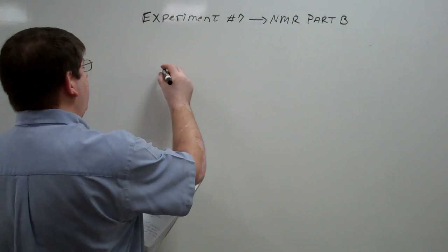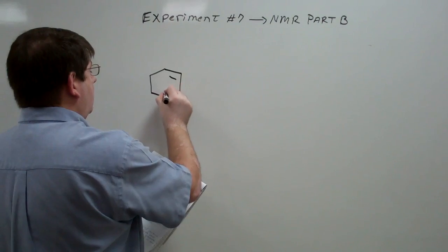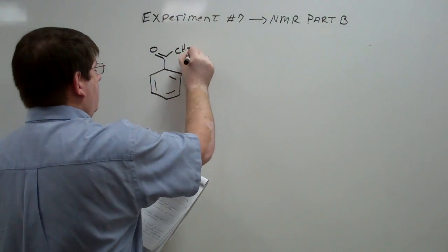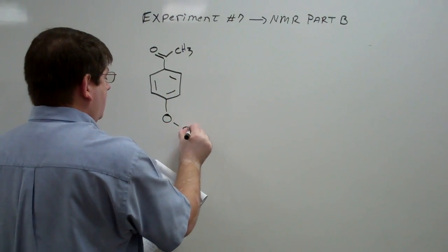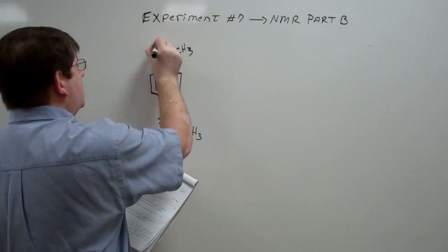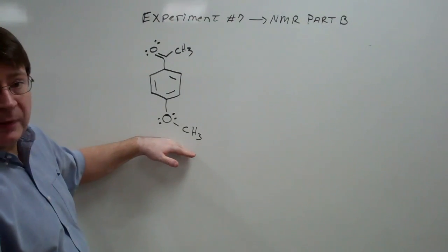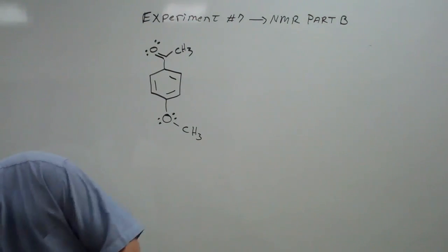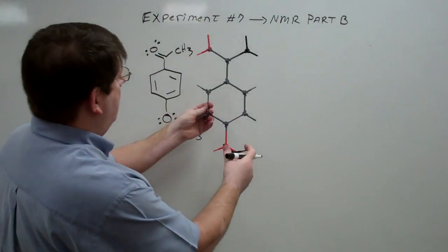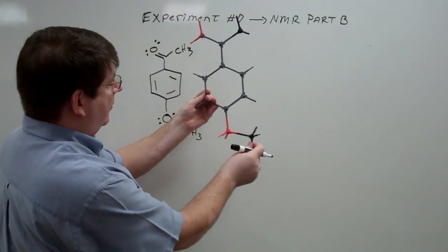And let's use the same example that we did for the proton NMR. Lone pairs of electrons. So we've got our sample that we're going to be looking at here, and I've brought along the model again to show you what that looks like by a model. So we've got our methoxy group here on the bottom, on the number 4 carbon.